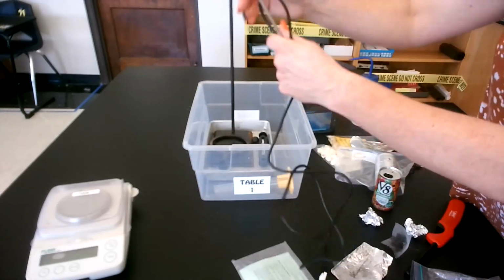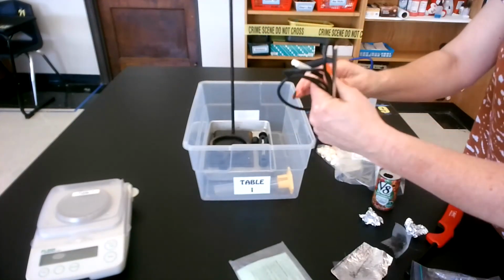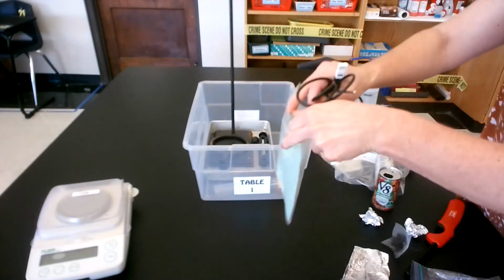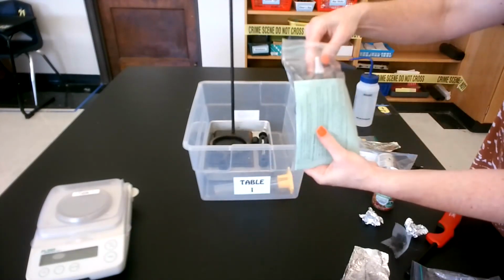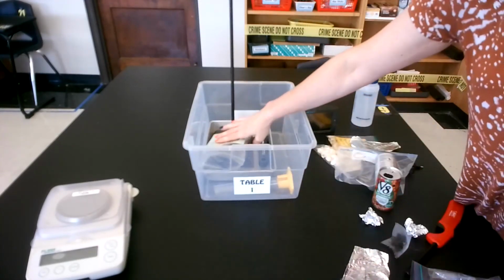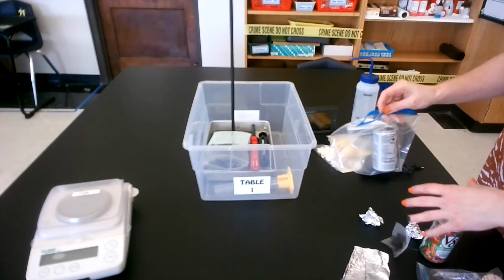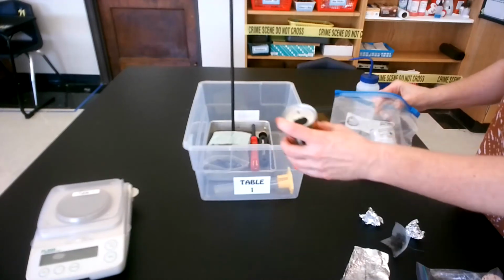The thermometer. I'm going to wrap this up, and I'm going to pay close attention to this clip. And then I have a bag. Again, careful, not that I'm jamming that in there. I actually hold onto that end to tuck it away. I'll put that up. Lighter goes up. Then I will have my cans. My cans will go, empty those at the sink and just leave them at the sink.